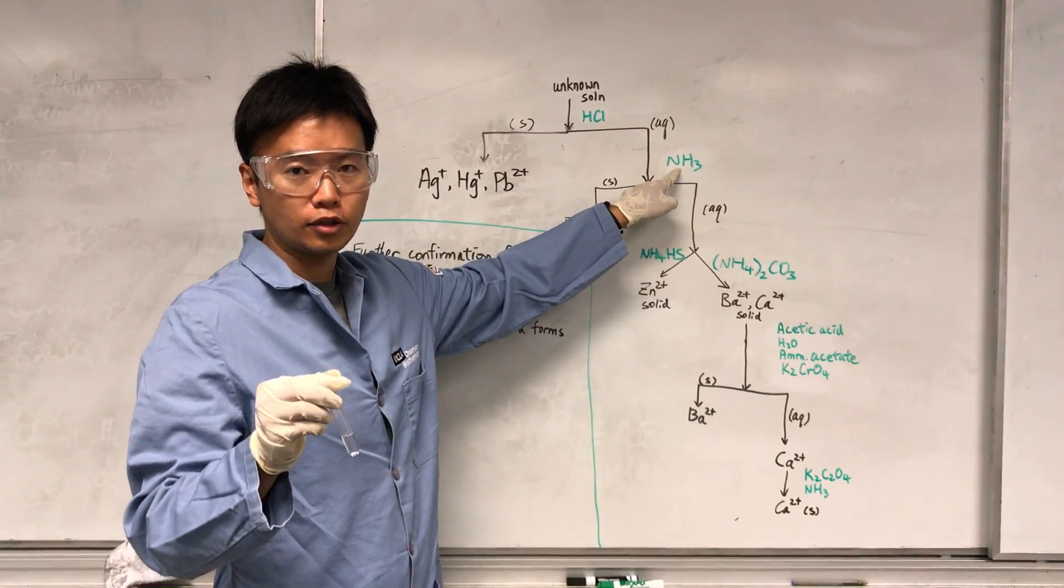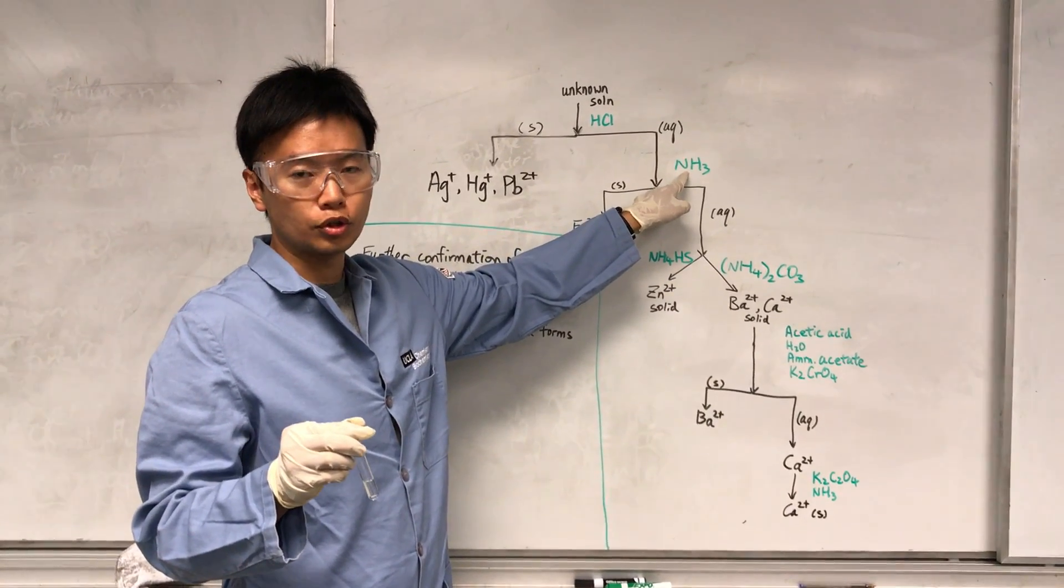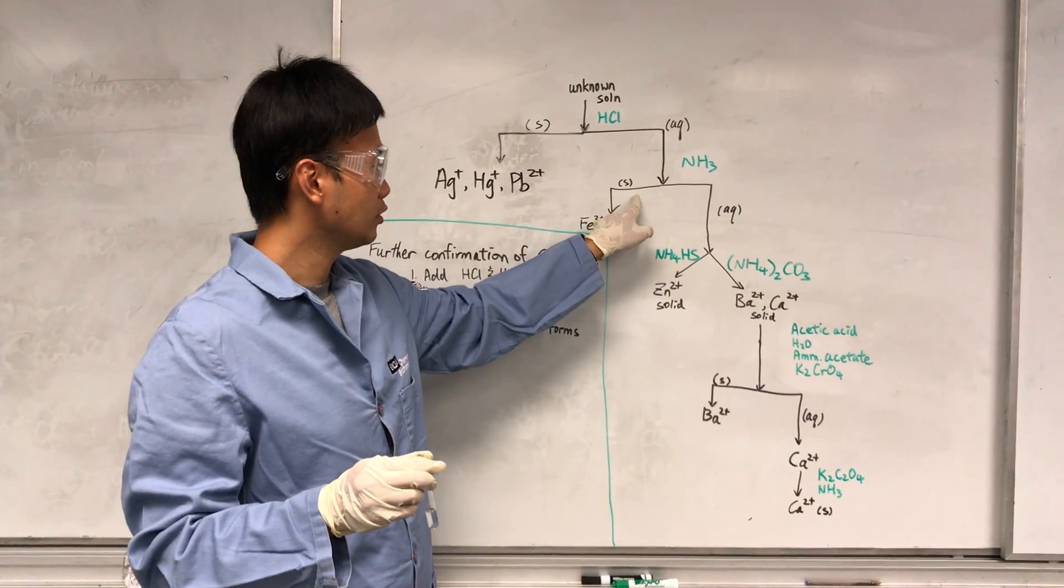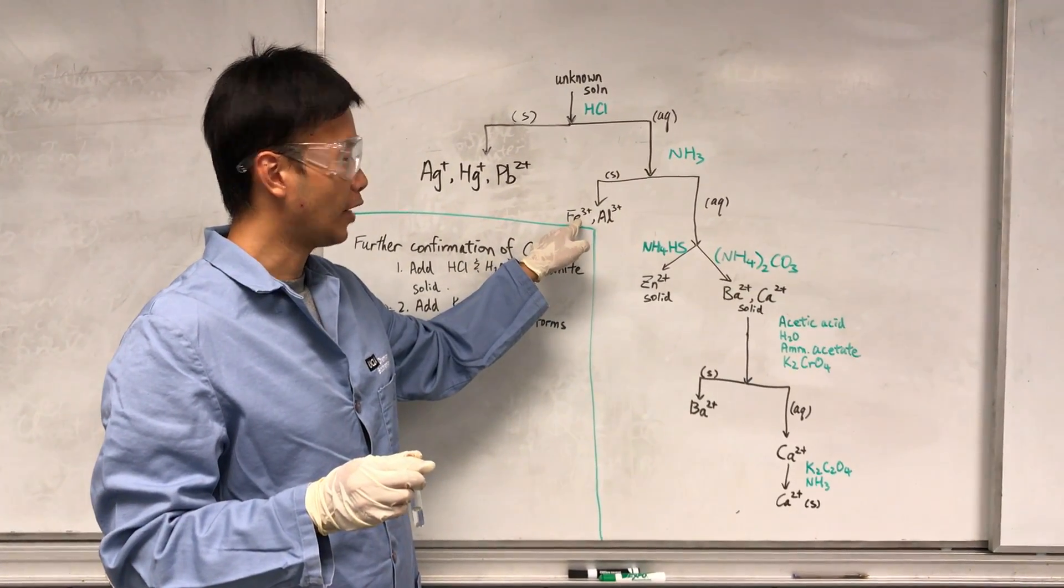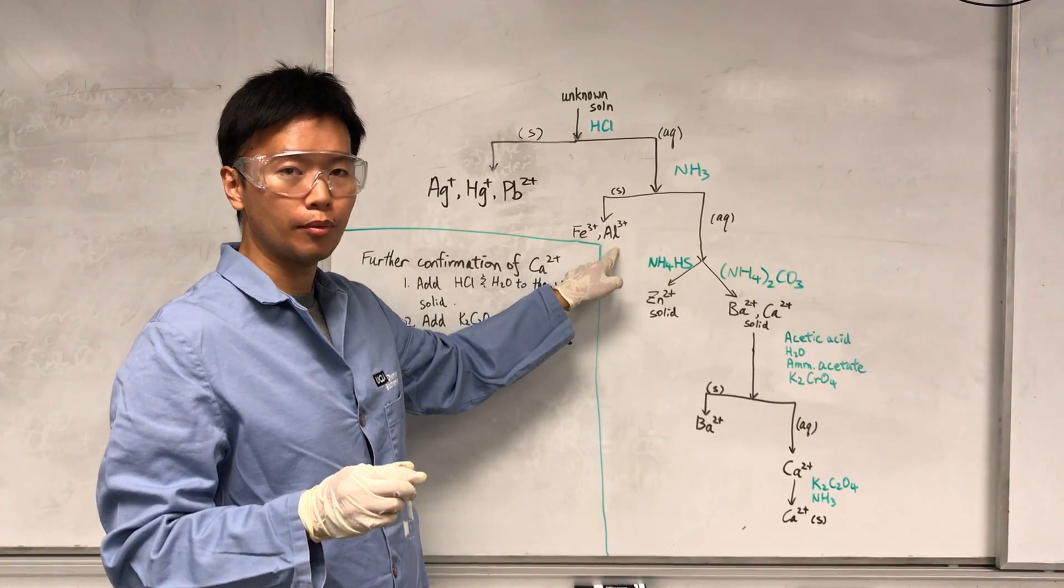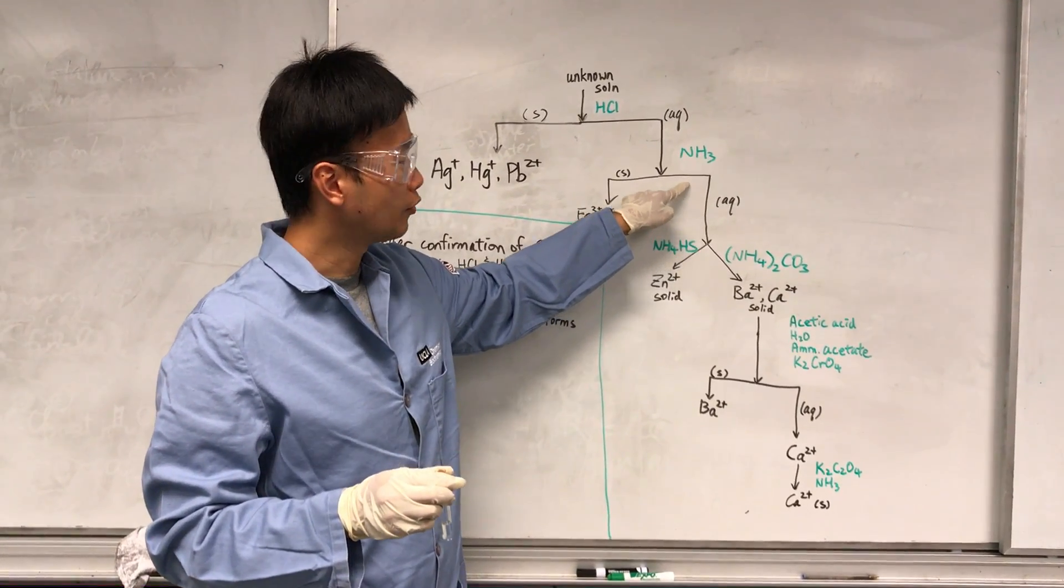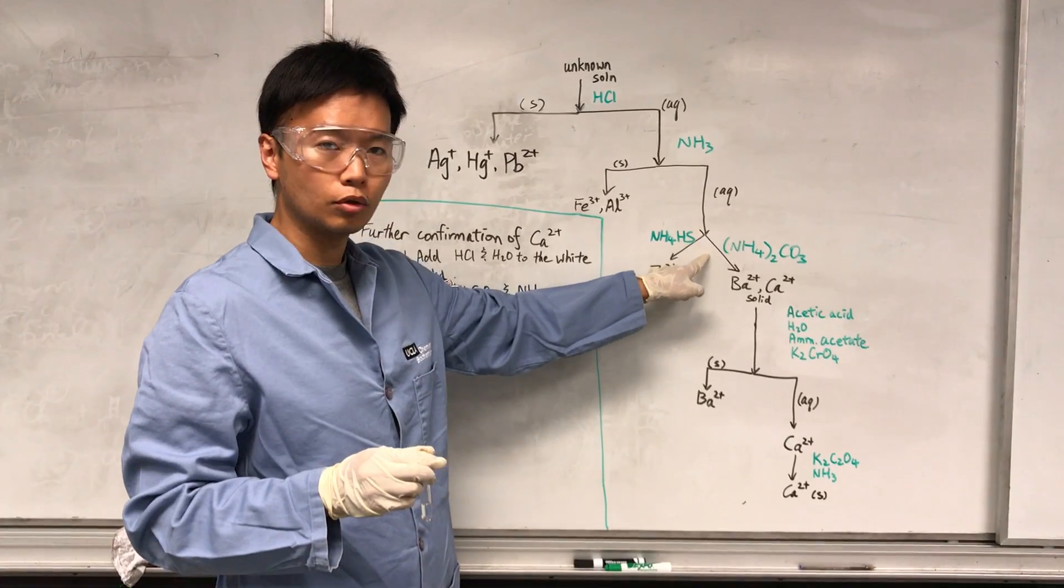Then I'm going to start adding NH3 to make sure the solution is basic and see if I see any solid. If I see any solid, that means I have Fe3+ or aluminum 3+. If I don't see any solid form, then I will continue to the next step.